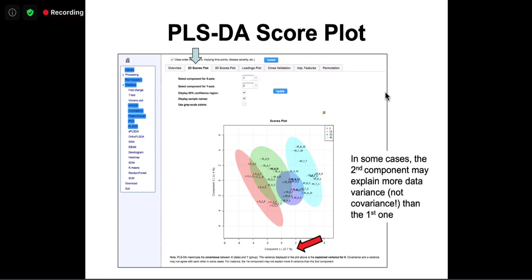Yeah, that's true. One of the things we could do is cross-validation even for PCA. I think I got that script around 10 years ago. We can plug it in and allow people to do that.